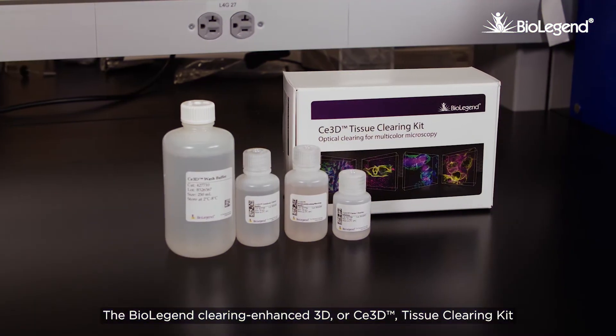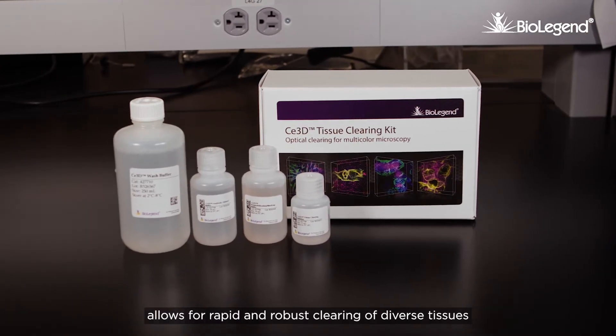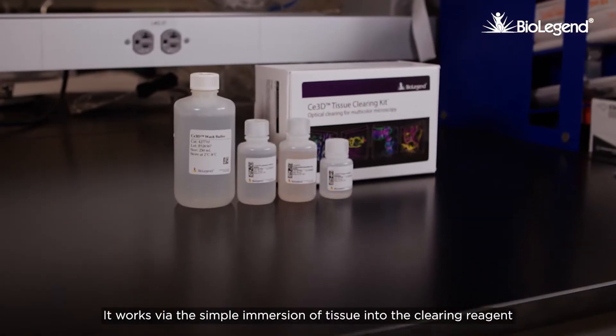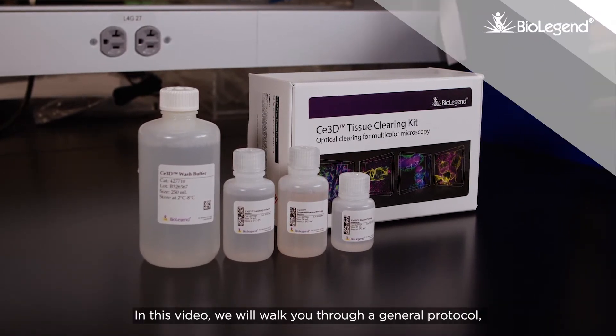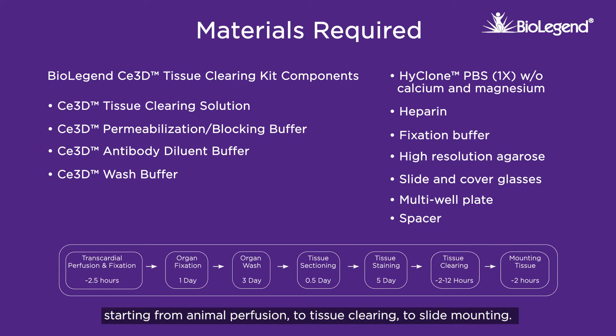The BioLegend Clearing Enhanced 3D or C3D Tissue Clearing Kit allows for rapid and robust clearing of diverse tissues for applications like multicolor fluorescence microscopy. It works via the simple immersion of tissue into the clearing reagent and does not require special equipment. In this video we will walk you through a general protocol starting from animal perfusion to tissue clearing to slide mounting.